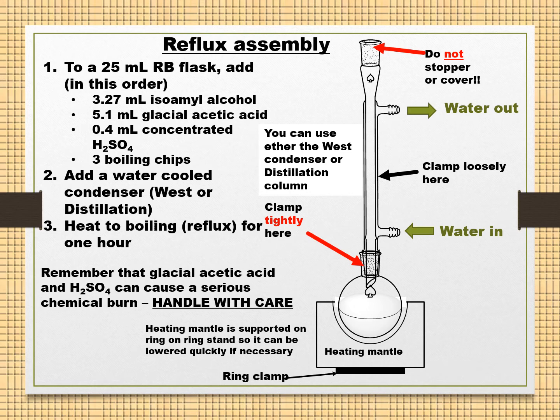And we are then in the important step of the esterification process.